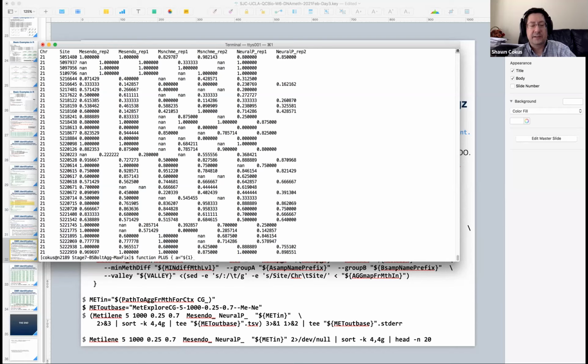It takes 2 command line arguments, which we'll rename A and B, and then we can compute the sum of A and B as a number. This paren double parens is a way to do arithmetic, integer arithmetic in bash, and then we'll just produce that output.